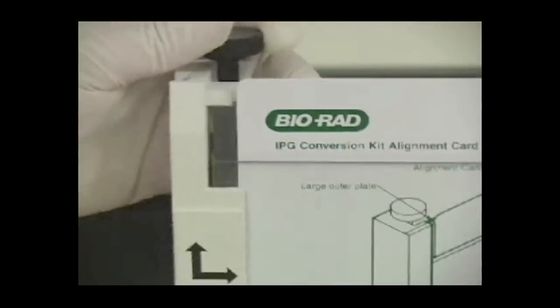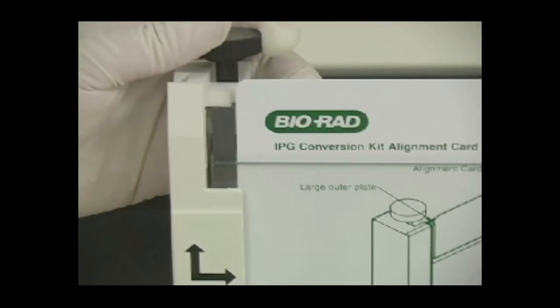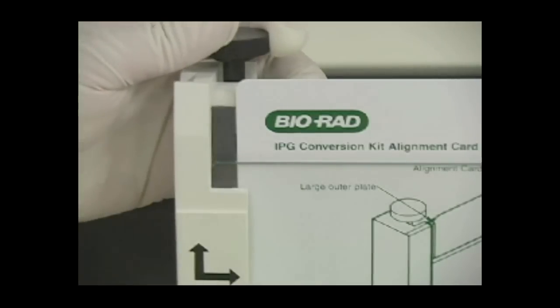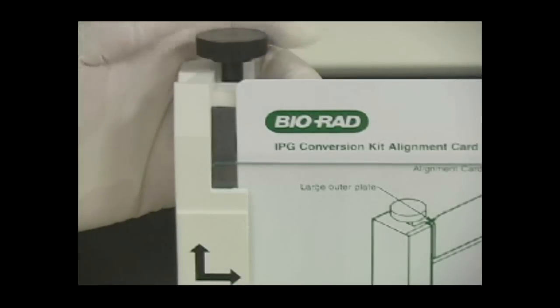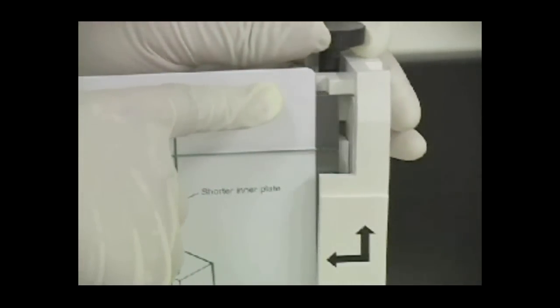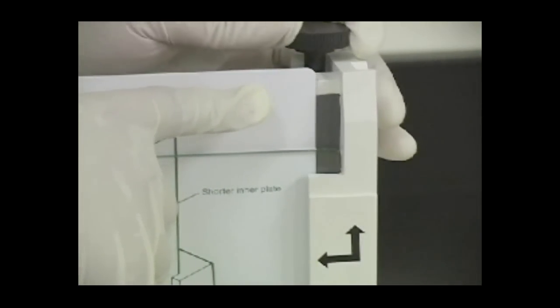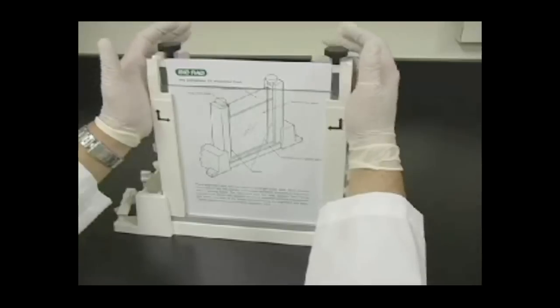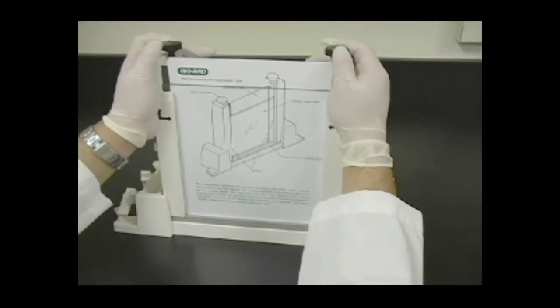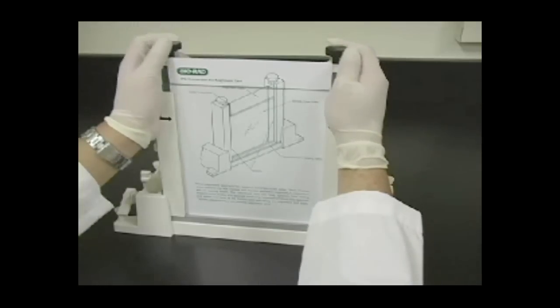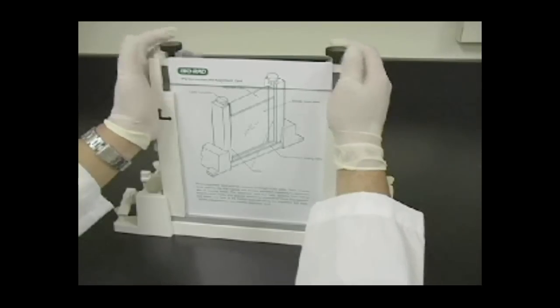Slightly loosen the clamp screws to check that the spacers are flush up against the top notches on the clamps. Simultaneously push inward on both clamps at the area around the arrows and tighten both clamp screws just enough to hold the sandwich in place. Pushing inward on both clamps at a point below the arrows will ensure that the spacers and glass plates are flush against the sides of the clamps.